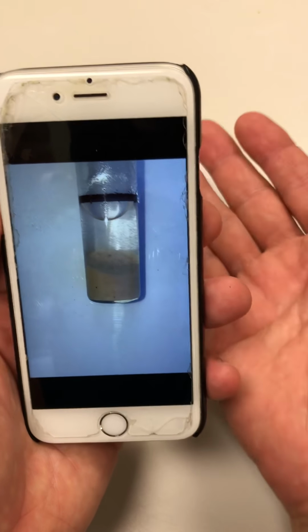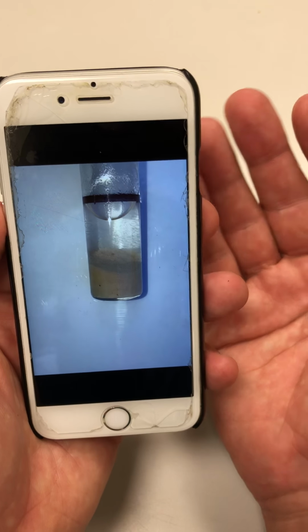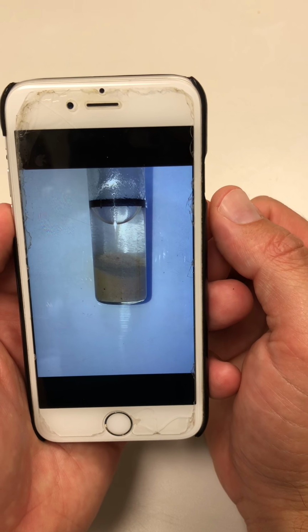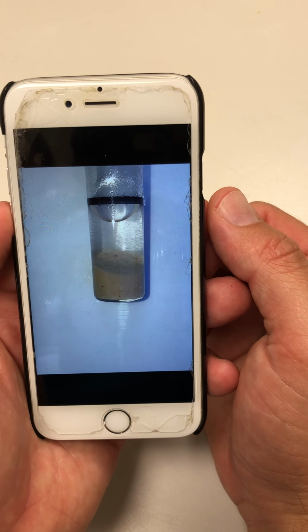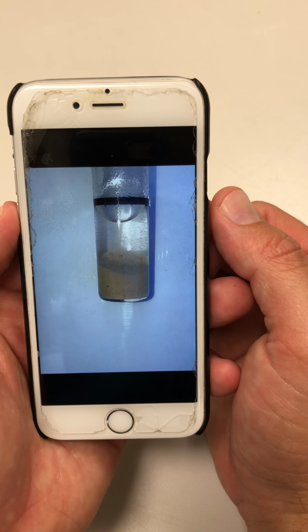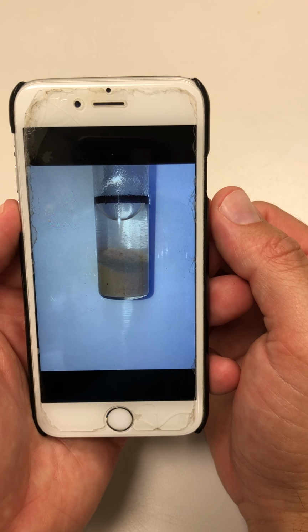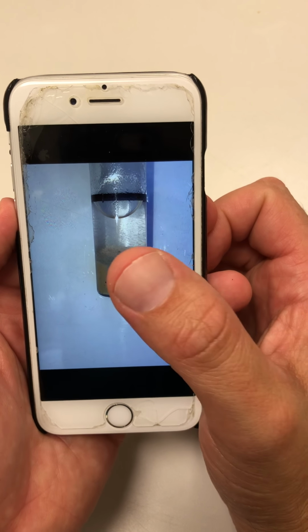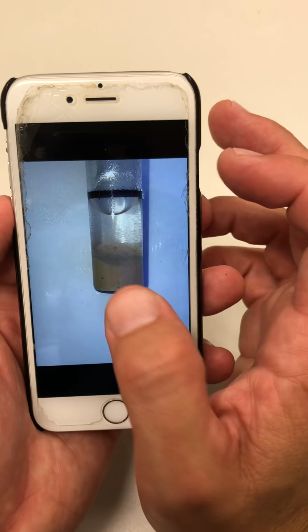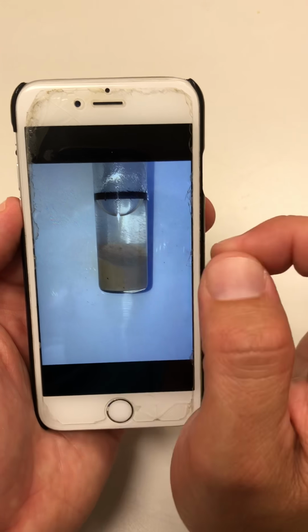What you want to do is, when you take that picture, make sure that you angle it such that you get it nice and illuminated by whatever your light source is. It's best in natural light, but it's no problem using fluorescent light or inside lighting. Also, if you happen to be outside and it's dark, there's no problem using the flash. All you'll get is a white glare against one of the edges of the glass, and if you can crop around it, great. If you can't, no big deal, because it's going to be averaged out anyway.